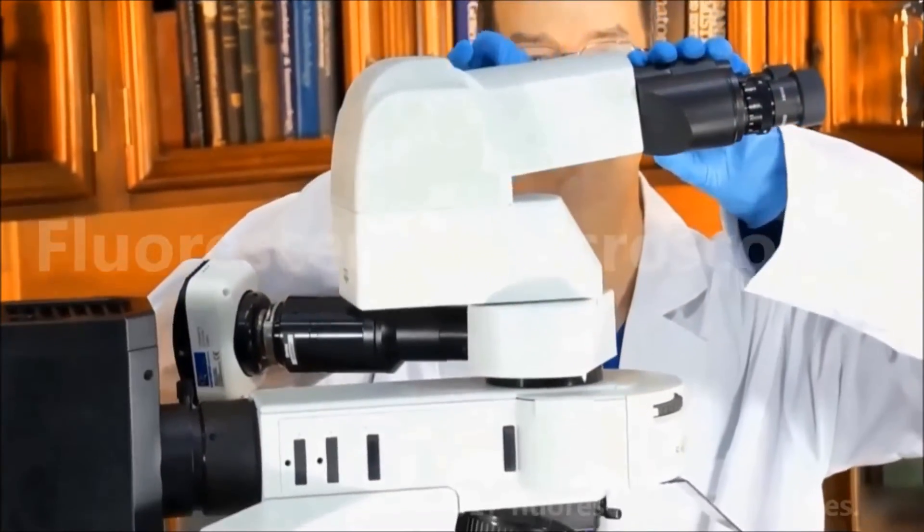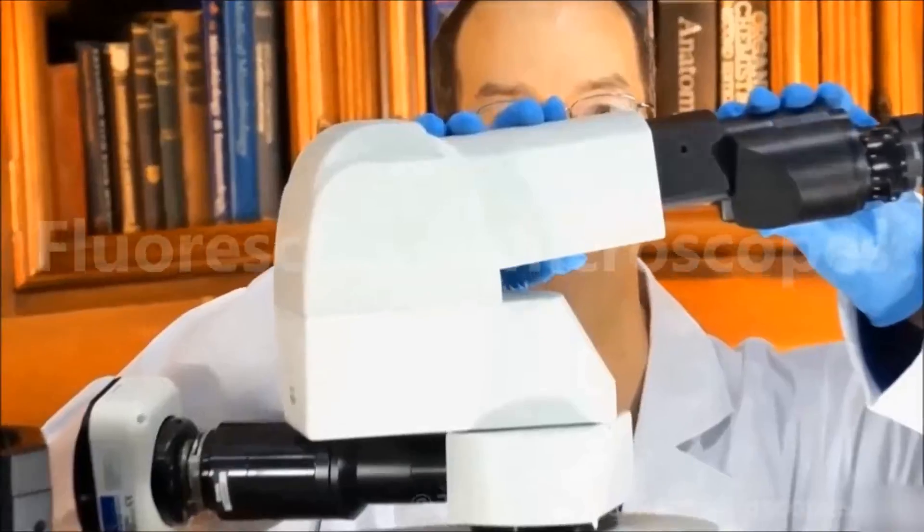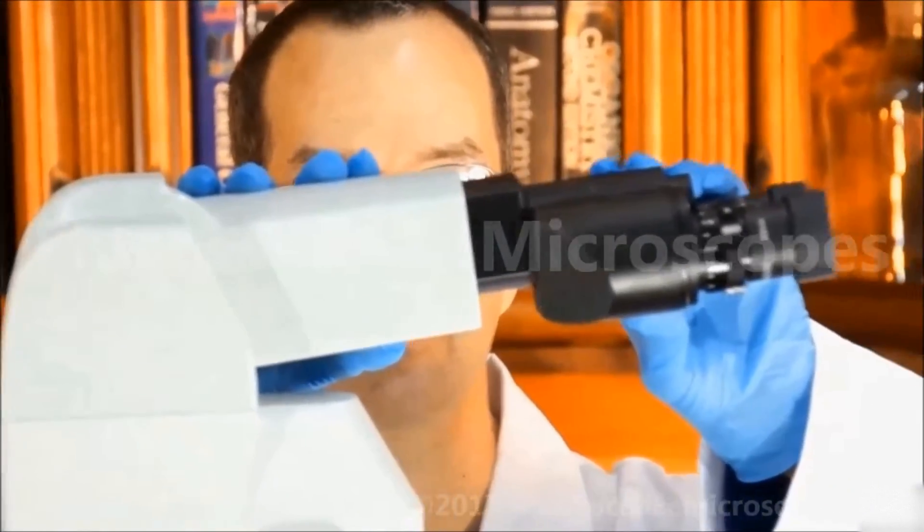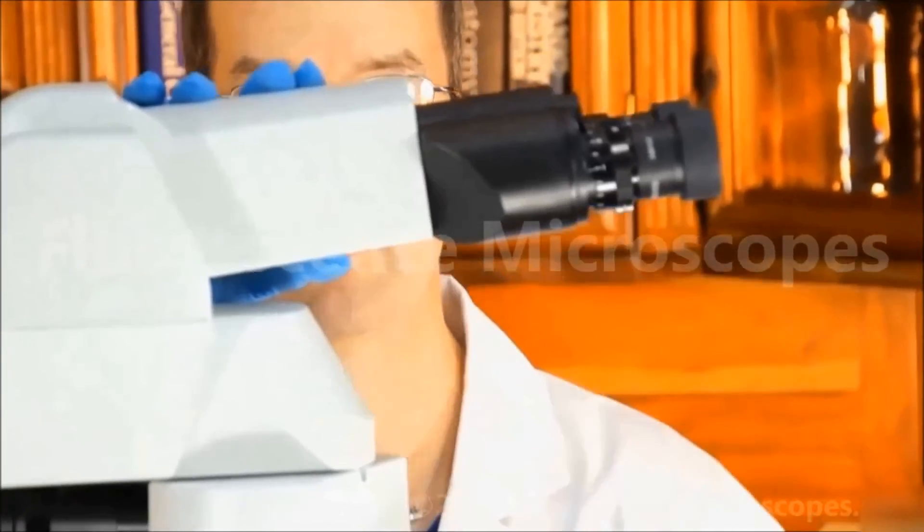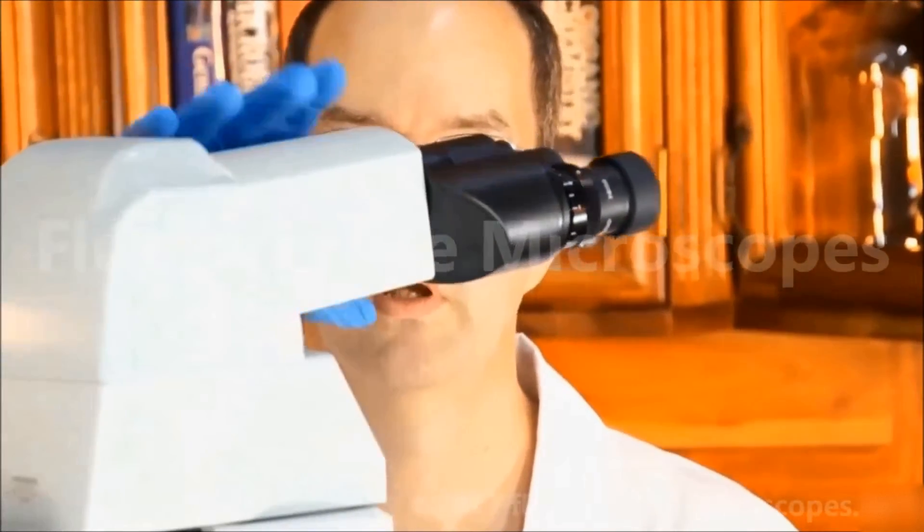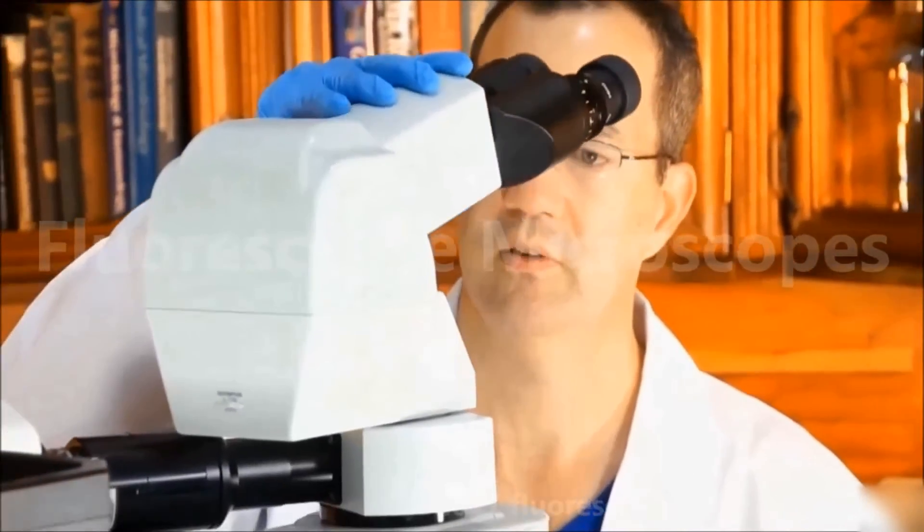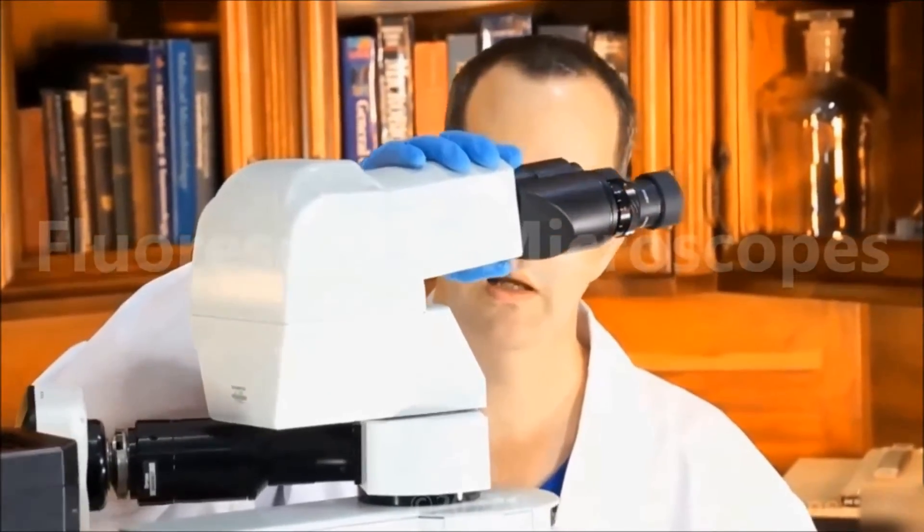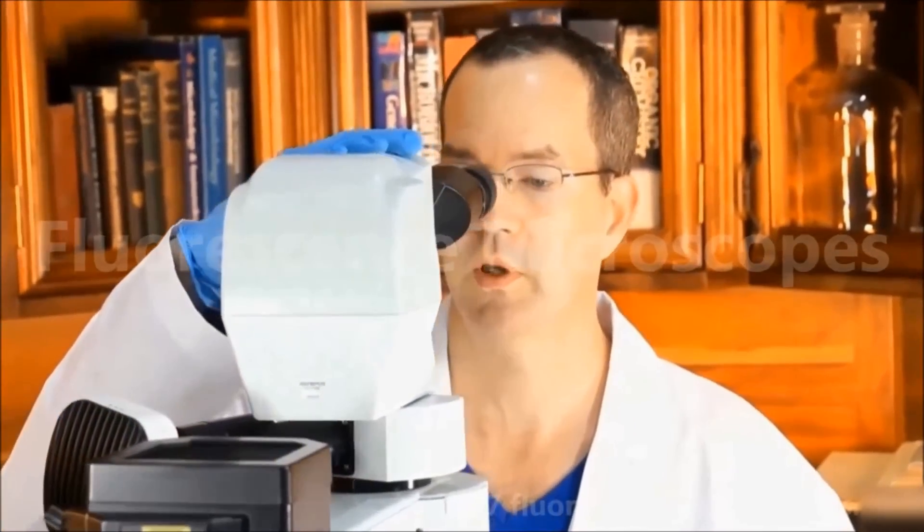In addition, we have a telescoping part. This is the best head. There are several other Olympus heads. This is absolutely the best, most ergonomic. It's very comfortable to use. And it can fit most any body, depending on what type of ergonomics you require.